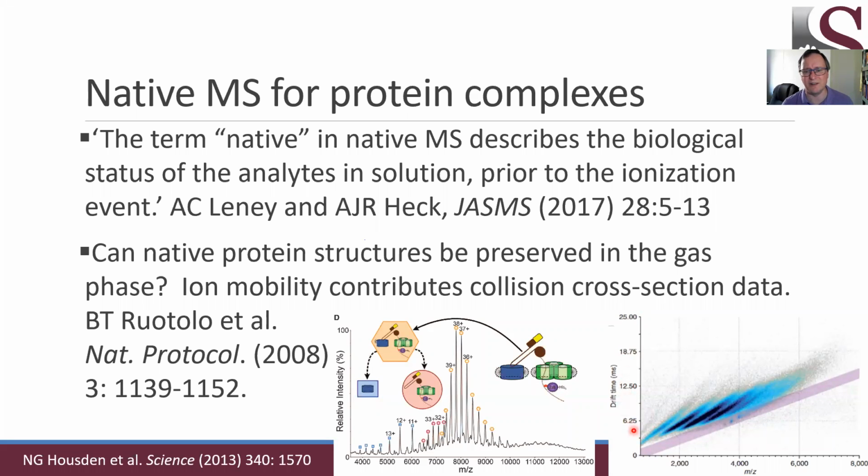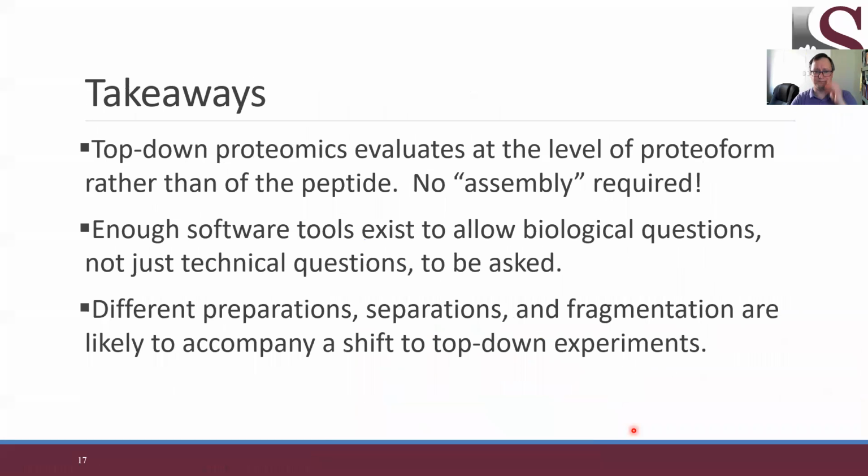Now you might be saying, this doesn't even look like a mass spectrum to me, and that's because you're probably looking for the intensity axis. In this case, it's coming out toward you from that. So a more darkly colored dot represents an intense signal, and one that's pretty low and gray is something that's close to the grass. Okay, so that's the very short guide of how to interpret ion mobility spectra.